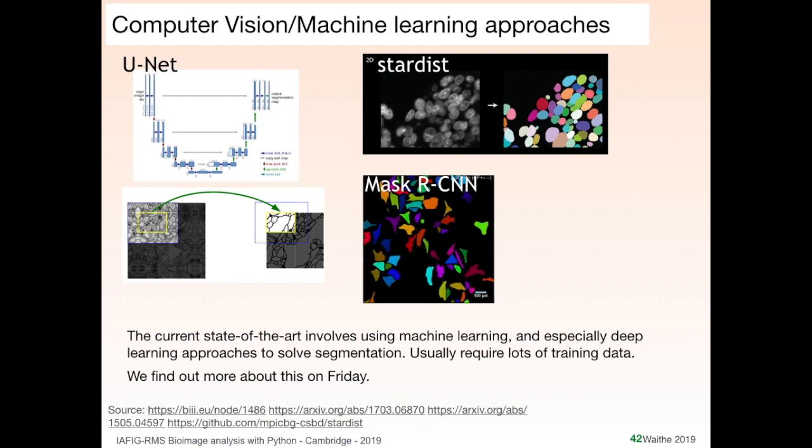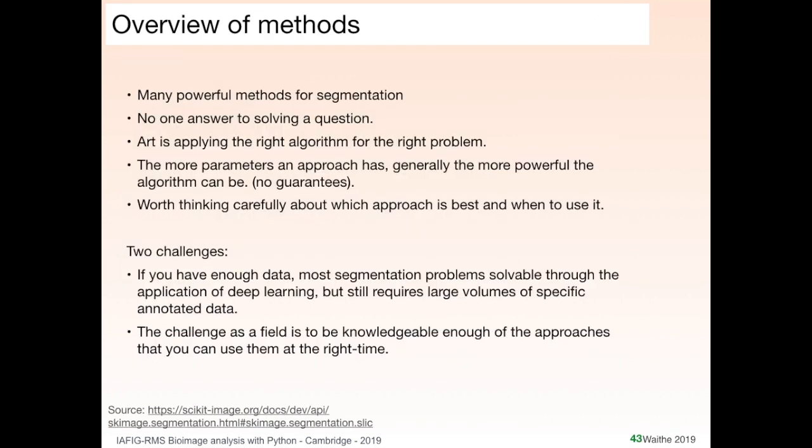So then here is an overview of the methods. There are many powerful methods for segmentation. There's no one answer to solving the question. The art is applying the right algorithm for the right problem. The more parameters an approach has, generally the more powerful the algorithm can be. There's no guarantees. And it's worth thinking carefully about which approach is best and when to use it.